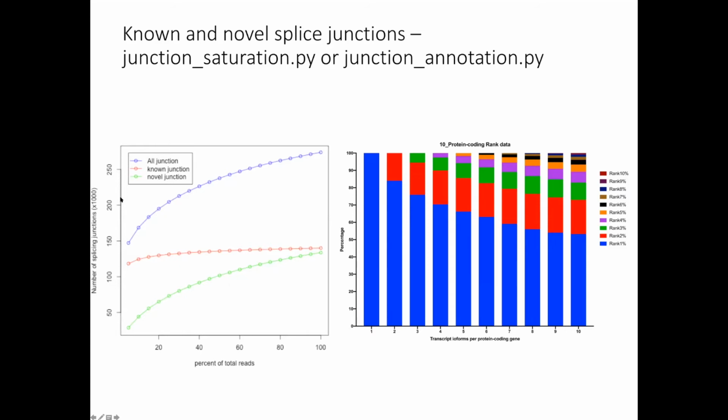So if I would have had this sample, I would have said that, okay, we have spent too much money sequencing too deep. We are not really getting much more novel information that is usable after this level here. So this is typically a plot where I would say that you spend too much time sequencing one sample. And I would have suggested that you would have sequenced 2 samples instead at half the depth.